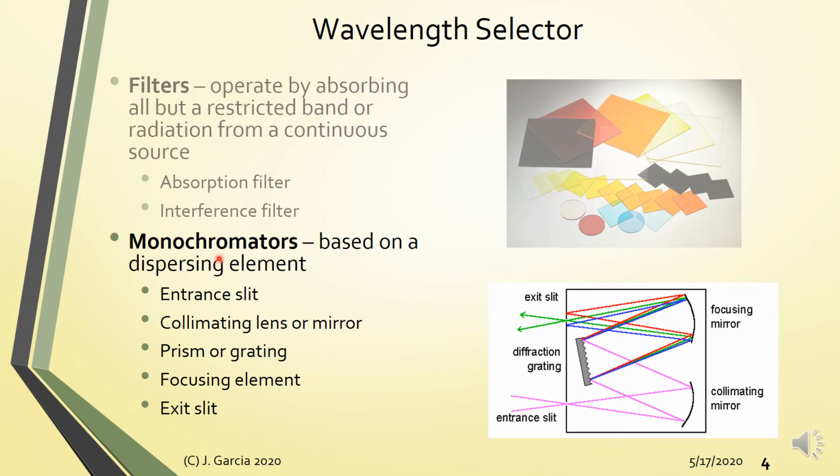Okay? The jargon used for different optical devices actually depends on whether they use filters or monochromators. If they are using filters, you call them photometers. So for example, you have your flame photometer. If you did your OJT in a soil laboratory or a plant research laboratory, they would still have that kind of instrument for analysis of potassium, sodium, lithium nutrients in the plant or soil. So flame photometers use filters.